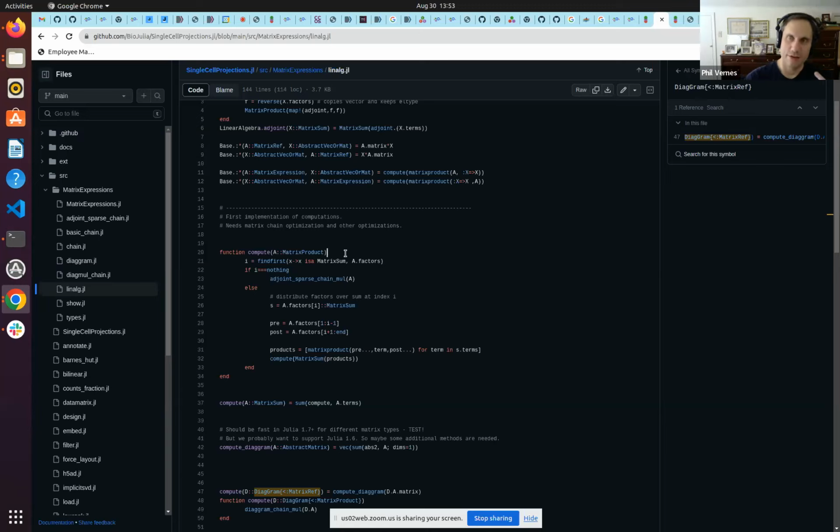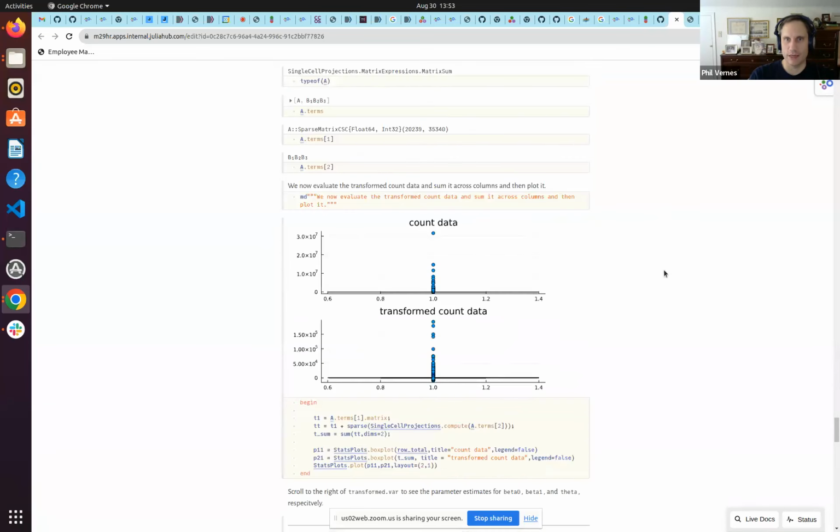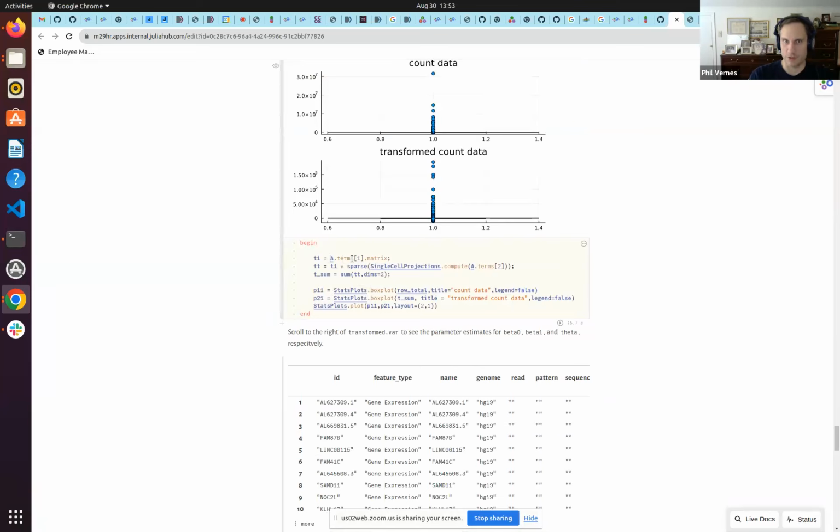But there will be times when you want to do stuff like I did, for example, when I decided to go into the data structure, into the data matrix itself, when it was no longer just a sparse matrix, it was now this custom type, right? This abstract type he made. You would not be able to figure out how to get in there and mess around, because sometimes you want to evaluate midstream what you're doing to check things. That's why I did it. I wanted to see, yes, he did a transformation, but I don't believe you, right? Show me. And that's how you do it.